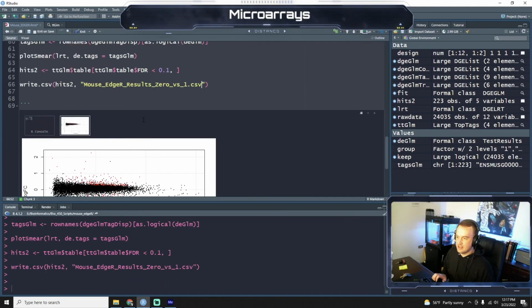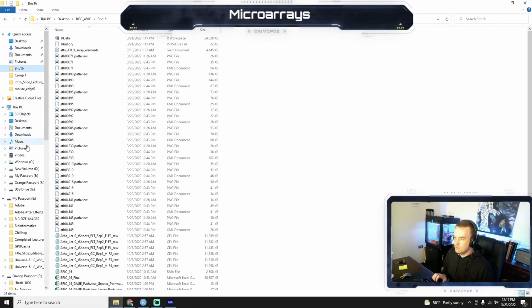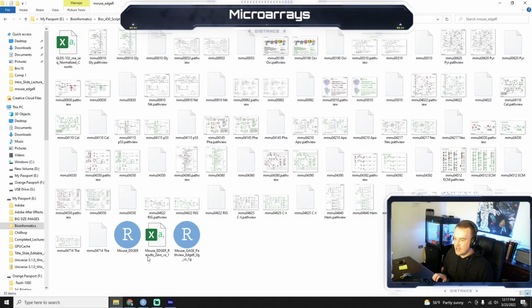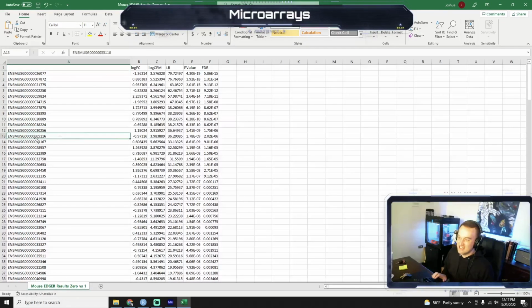Okay, so I ran that. So now in our folder, Bioinformatics, scripts, EdgeR, we should have mouse EdgeR, and we just created a CSV from that table.